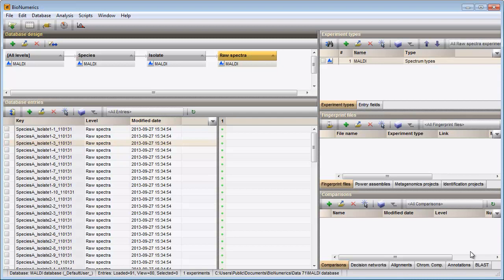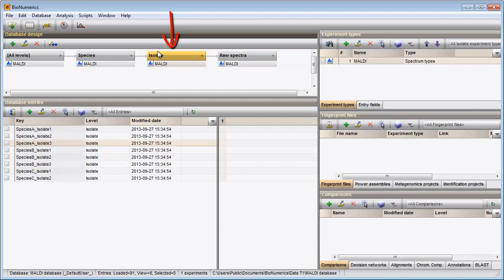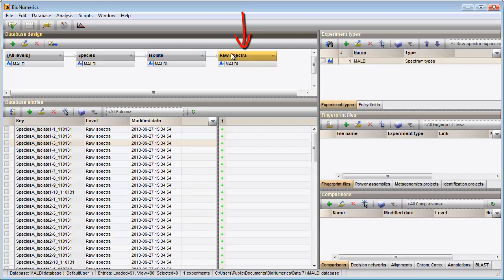My dataset consists of spectra from three species. For each species, several isolates have been analyzed, and for each isolate there are multiple technical replicates. The spectrum type MALDI is present in the Experiment types panel.